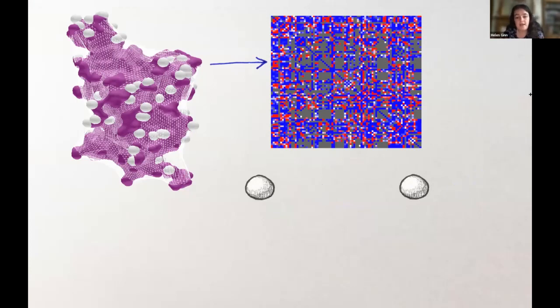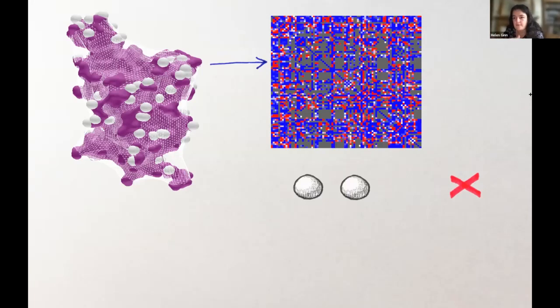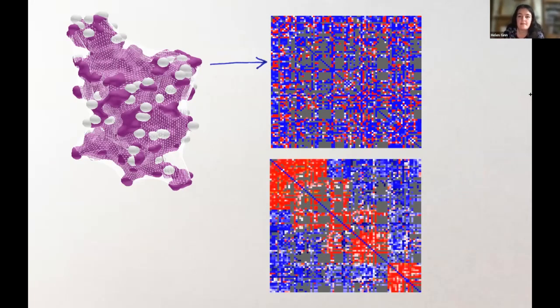On the other hand, you may have some which are much closer together, in which case they're going to have a red value. So they do compete, they're not able to bind at the same time, and from that we can generate this predicted matrix. That's actually a sliding scale, so it goes smoothly from red to blue. And then we just want to jiggle around the antibody positions until that competition set looks like that of the data that Darming collected.